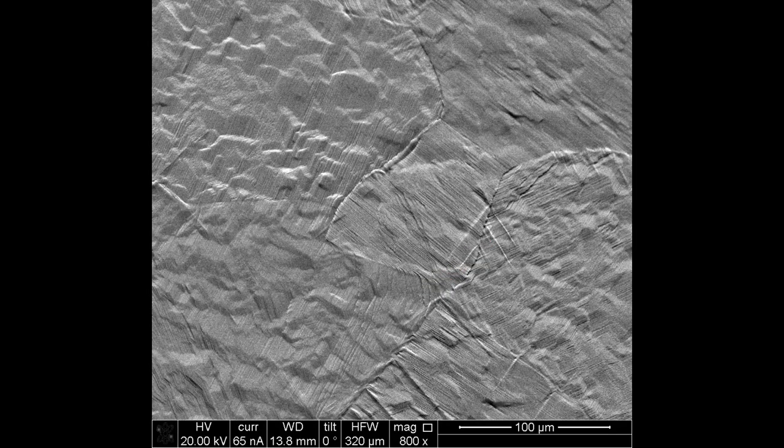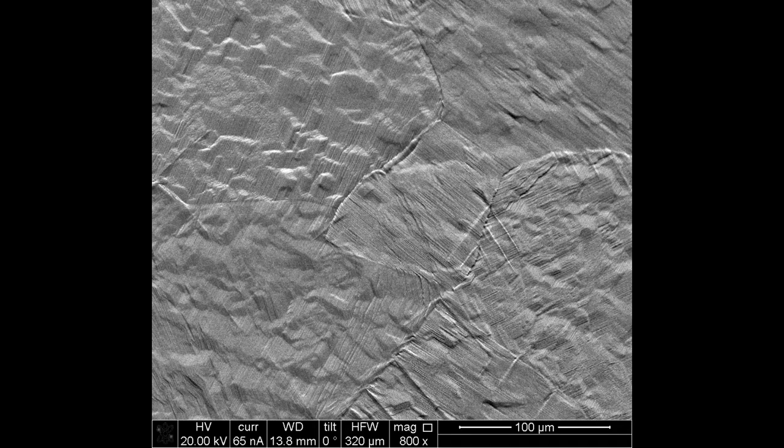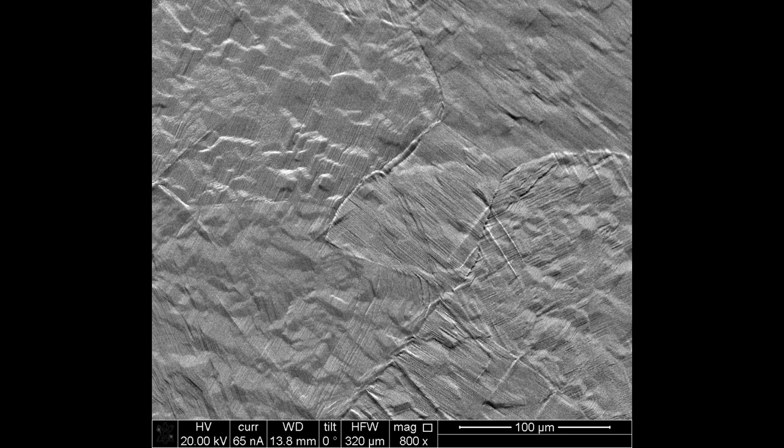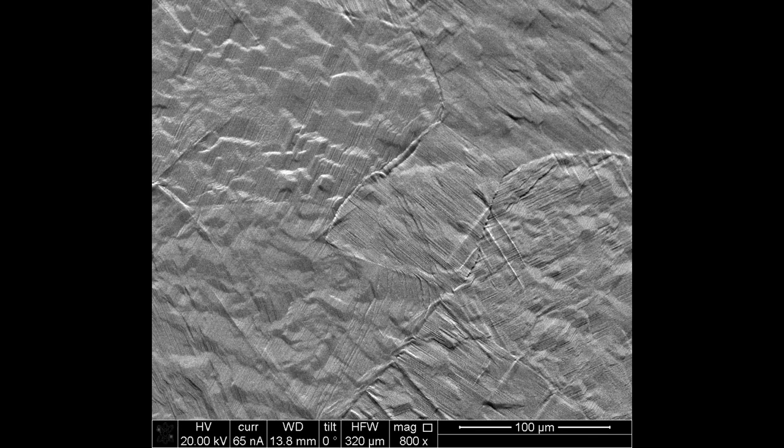It's particularly interesting that there's no apparent alpha allotriomorph at the grain boundary at this point. This suggests that it's not necessary for the alpha nucleation. This is discussed more in the paper.